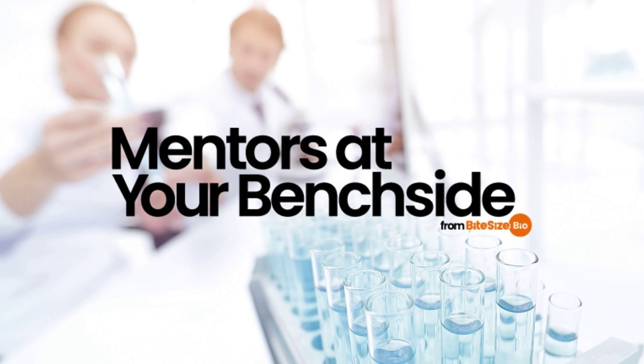In cryo-EM, liquid ethane is used to cool samples to minus 188 degrees centigrade. Samples must be kept thin, very thin. With cryo-EM, the goal is to image potentially hundreds of thousands of single particles and combine them into orientational classes. Hold this thought. So for plenty of excellent reasons, the ideal sample thickness is the maximum sample particle dimension. A typical particle might have dimensions of 10 to 100 nanometers, which correlates to 100 to 1000 angstrom.